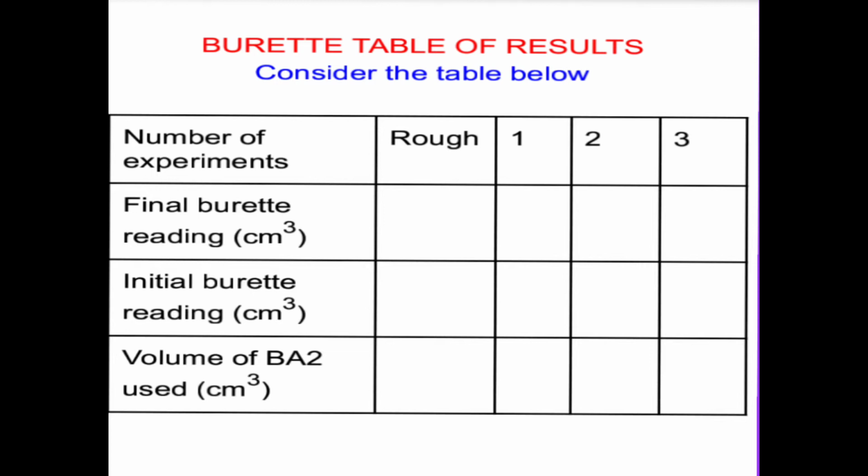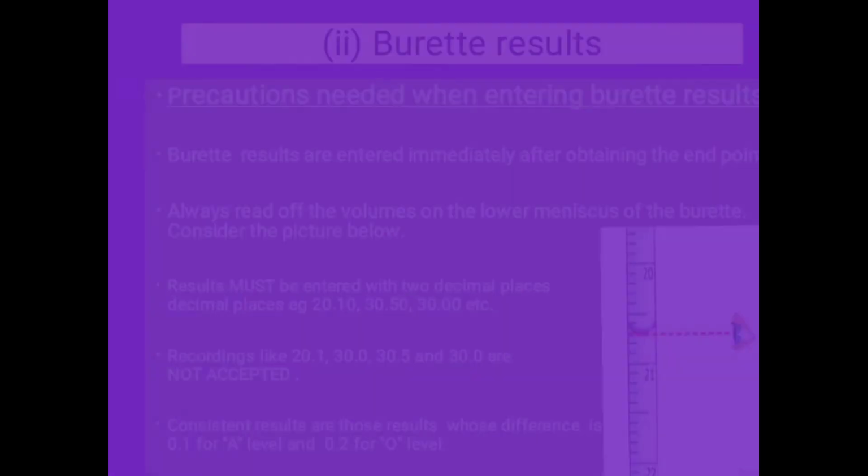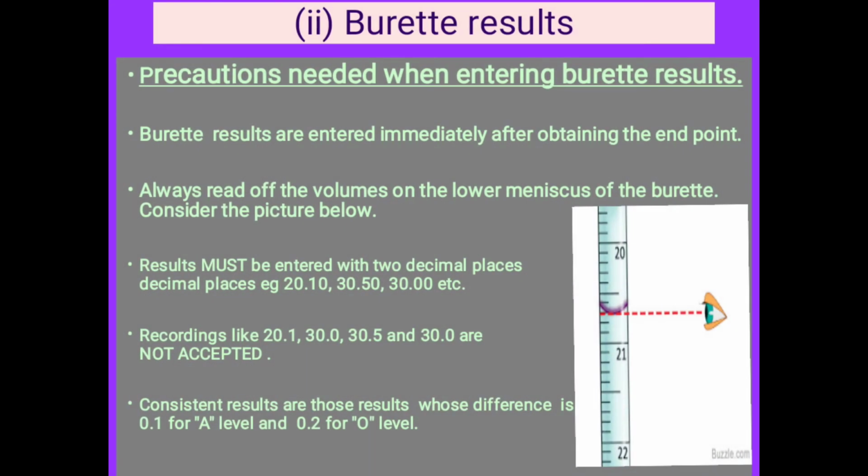So therefore, the following experiments after the rough are considered to be accurate. Let us now look at the precautions we need when we are entering the results of the burette. Of course, we have said that the table contains results from the burette.